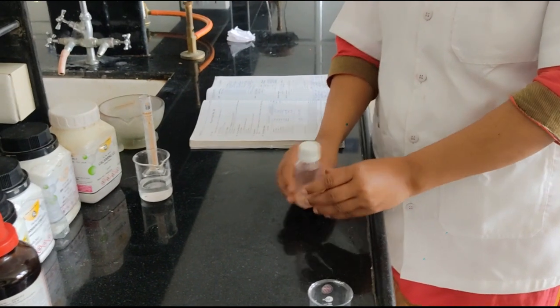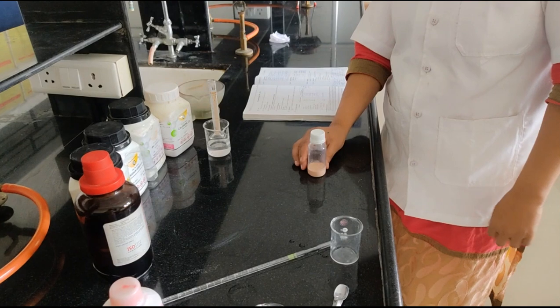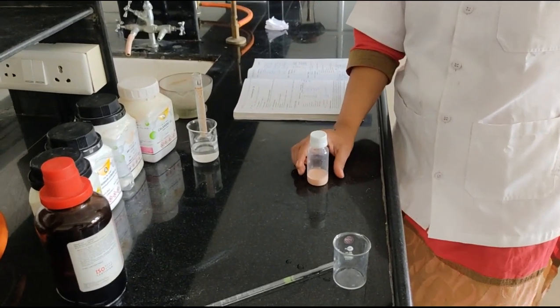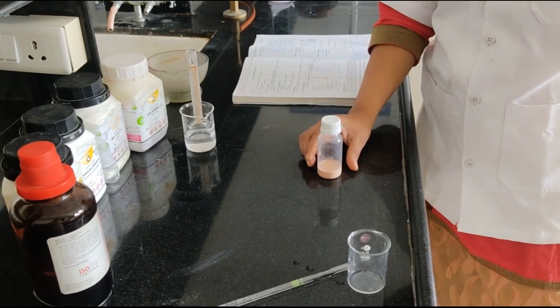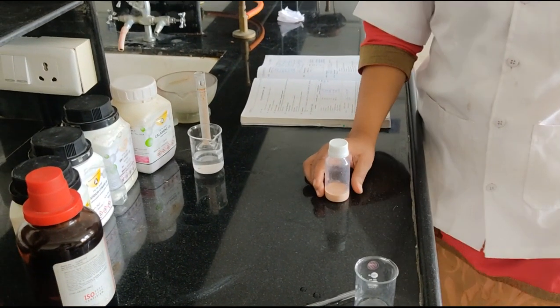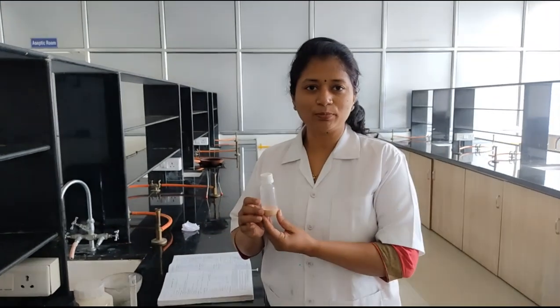Appearance of our calamine lotion is a pink color. Fragrance is perfume, though we use rose water or rose perfume, purified water with the rose flavor. Its pH is about 5 to 8, consistency is semi-solid, and rate of sedimentation is low. So in this way, our calamine lotion IP is ready now.